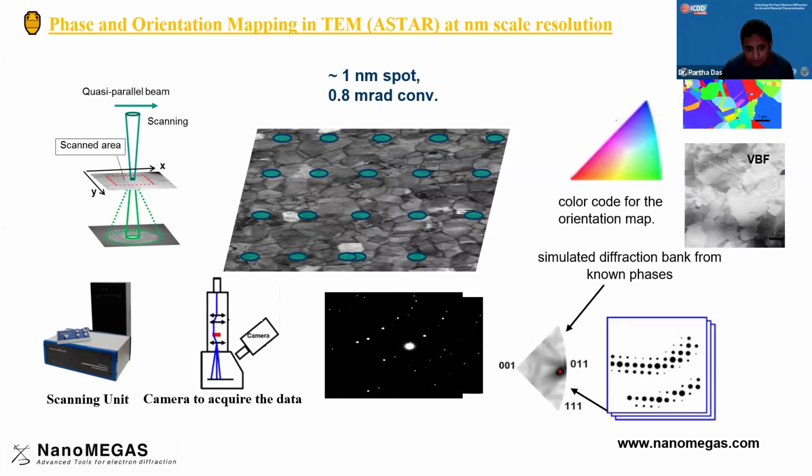Basically, each pixel of your collected data is color coded by its orientation with the stereographic projections. And with these methods, you can study several microns of sample to see the phase and orientations of the crystals. But the important thing is you need to know the crystallographic phase. It's not a methodology to determine unknown structures of your materials.